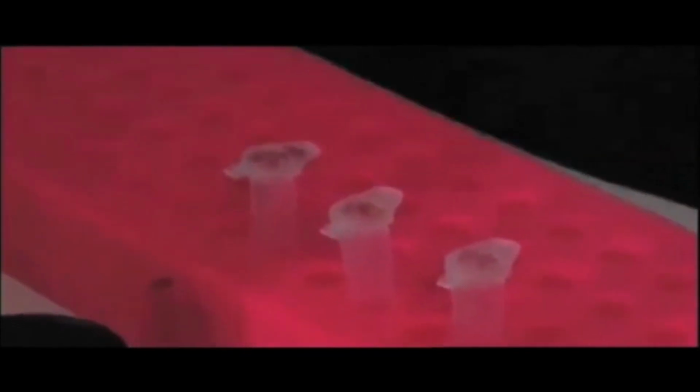Thaw these dyes using a mini centrifuge. Now label the tubes properly.